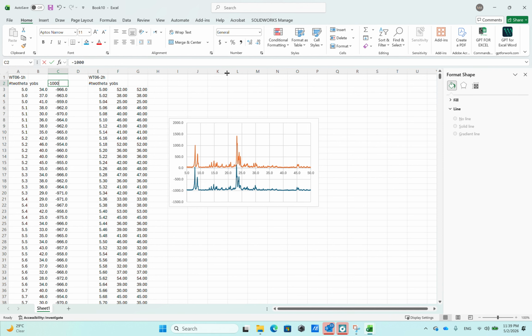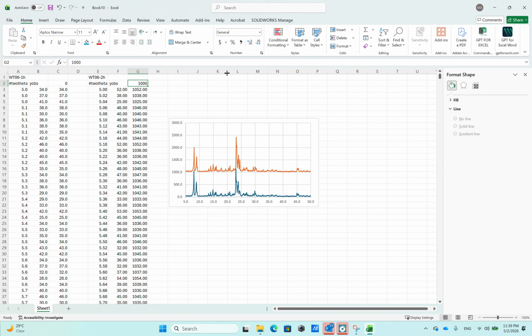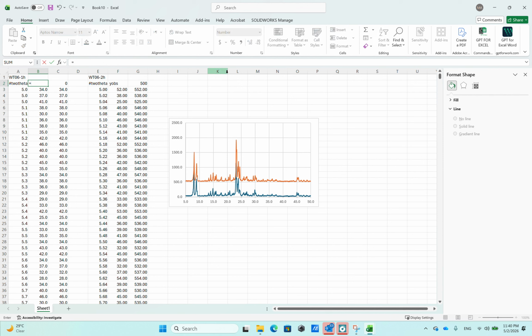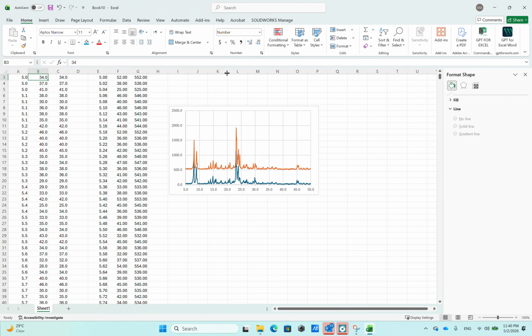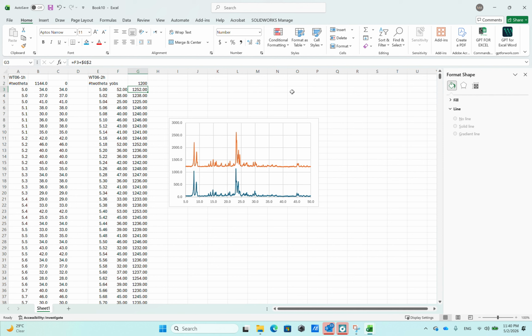So usually the first sample is going to start from 0, but the second sample you can shift up. Sometimes you need to make trial and error more than one time to see what is the best fit. But there is another way where you can guess easily, just go to any empty cell for the first sample and make it equal max, just to see what is the maximum value in the y-axis. So from here we understood that the maximum value is 1100, so simply make it 1200 and so on.